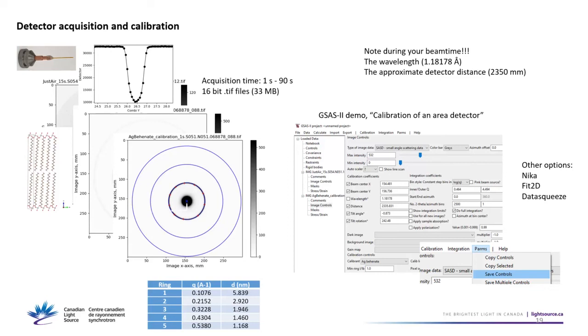Now I should have cut these off here because apparently the Nika one actually does the conical sections that GSAS does. So that one's good. But those other two, yeah, I'll cut them for the next presentation.